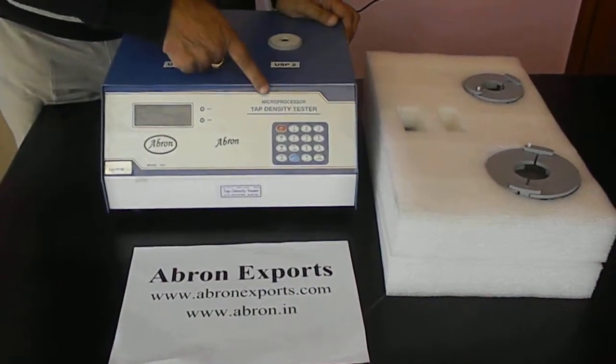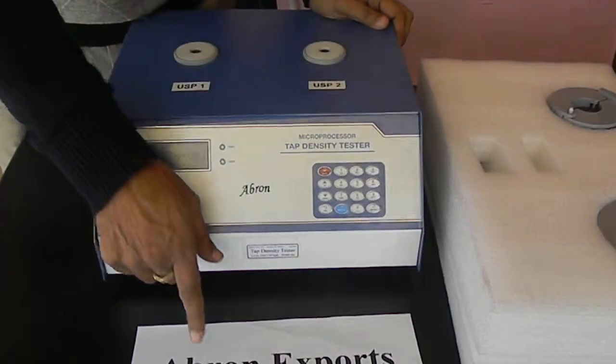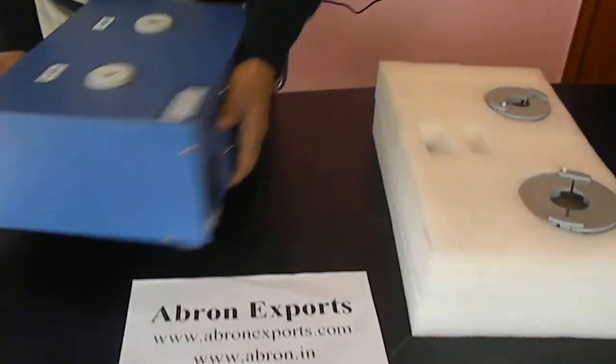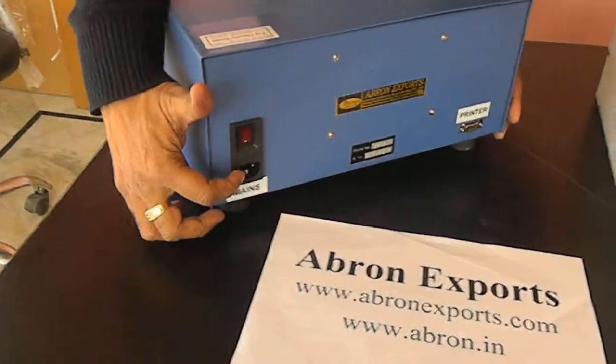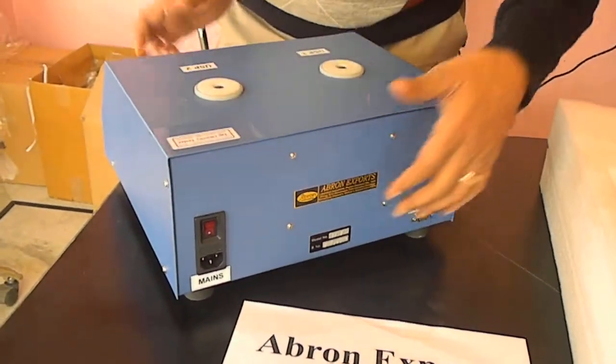This is a tap density meter tester, automatic microprocessor based by Abronxports. When you open the instrument you can have two parts. One is the instrument which has an on-off switch and power unit on the back and printer output on the back side.